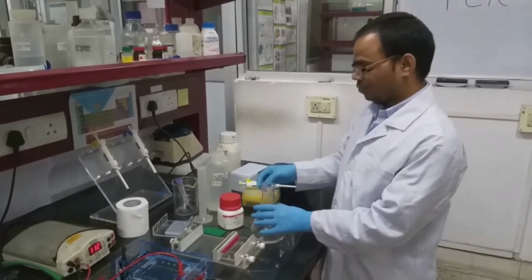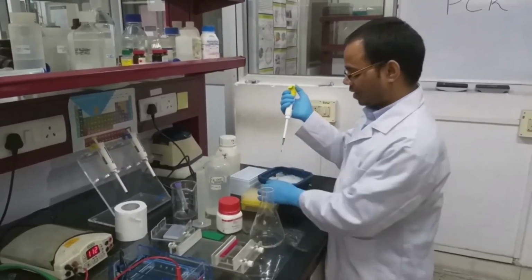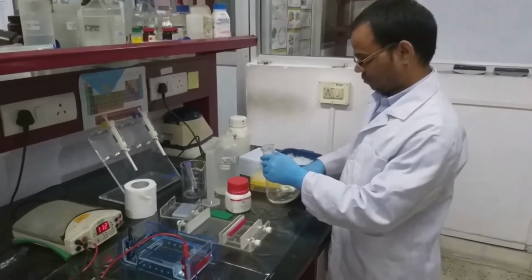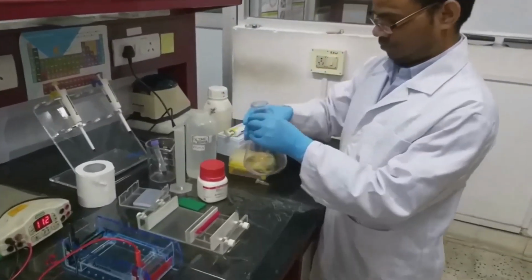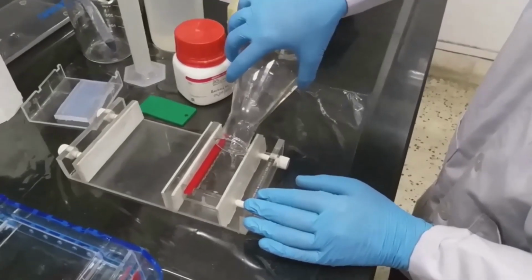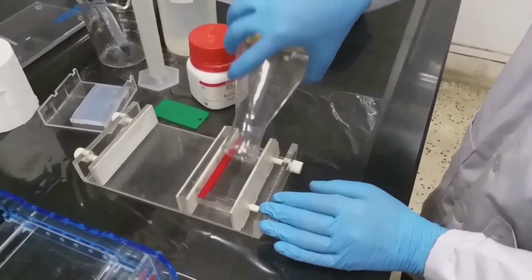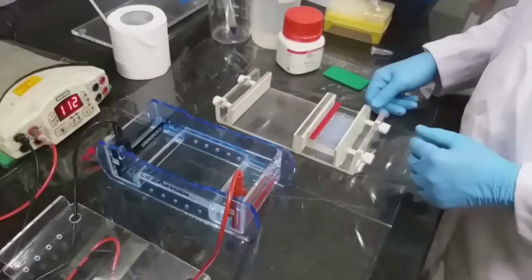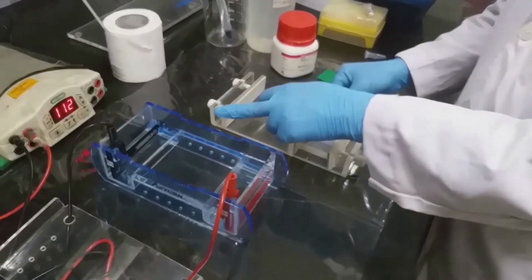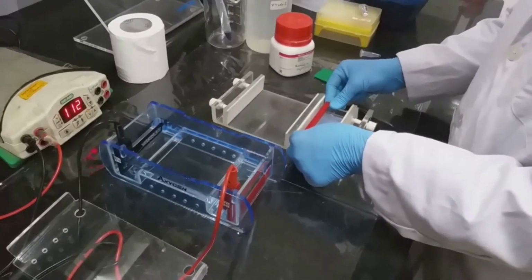Now before pouring, we have to add ethidium bromide for detection purposes. Now the gel has solidified. We have to take out the gel and keep it in the electrophoretic apparatus. We have to gently remove the comb.